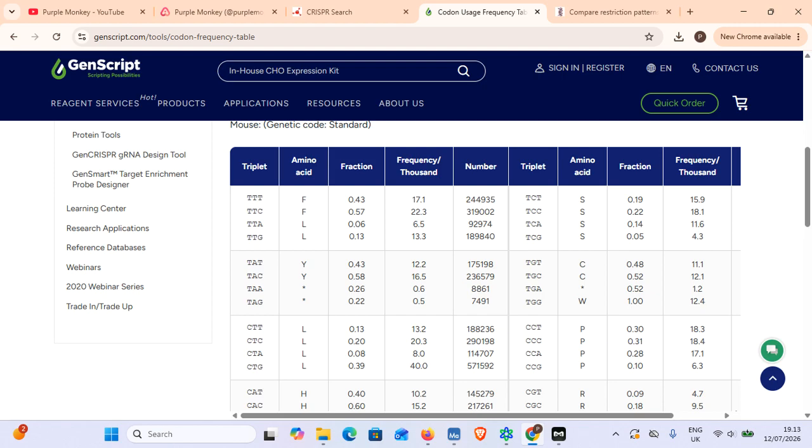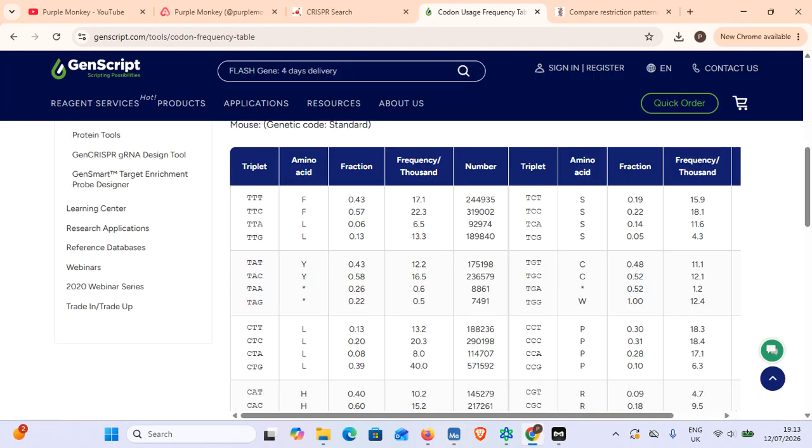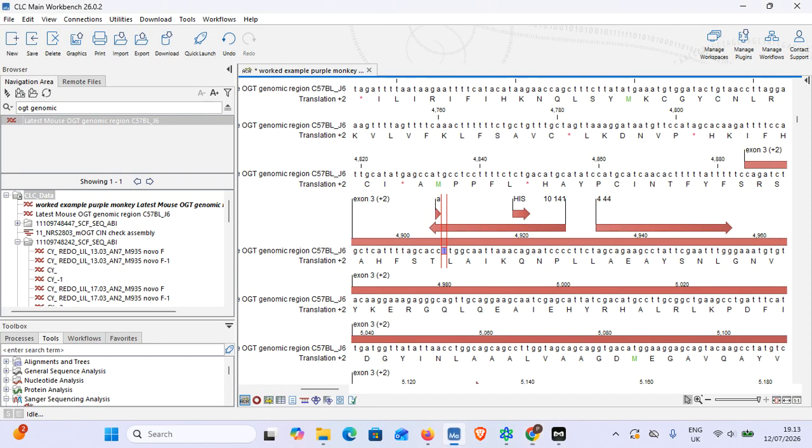Yes, the most nerdy popularity contest to win. So that's CTG right there. So let's pan over to here, and oh no, it's TTG, so CTG is not the best, well, best as in change, so let's actually swap to CTC. That's the 2 for 1, so I was getting ahead of myself.